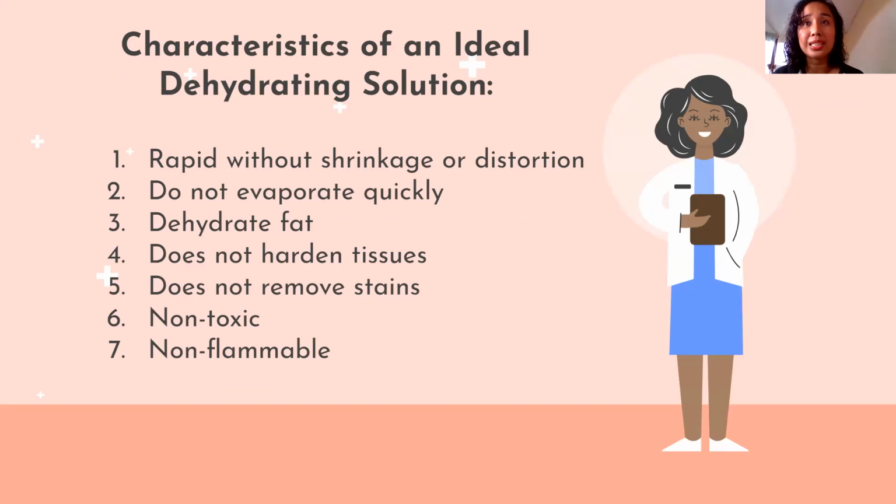Isn't it our goal is that the morphological structure will be seen, diba? The morphology should be clear. So what's inside the body should reflect the morphology of the cell of the tissue outside the body. So dapat ang dehydrating agent class, it won't affect the morphology of your tissues and cell.